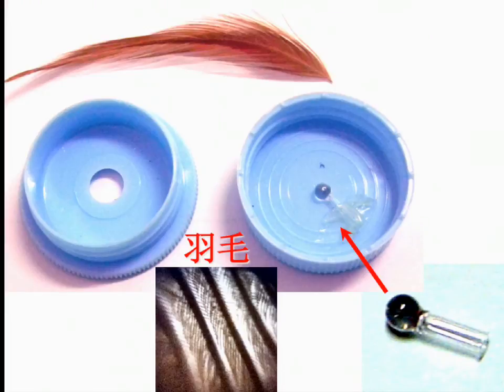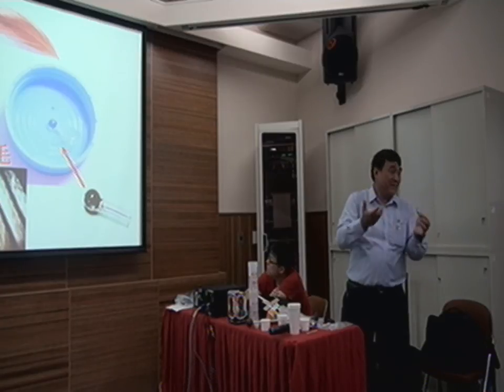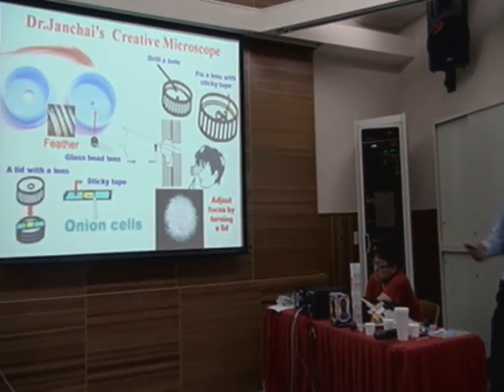Now I modify it a little bit. I'm using a plastic container. Make a hole just to let the light pass through, and this is the lens. Do the same thing — if you want to see something, put your face over here and have a look. It's really simple. This is a creative microscope.